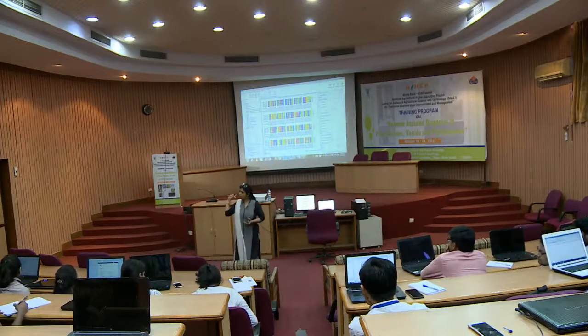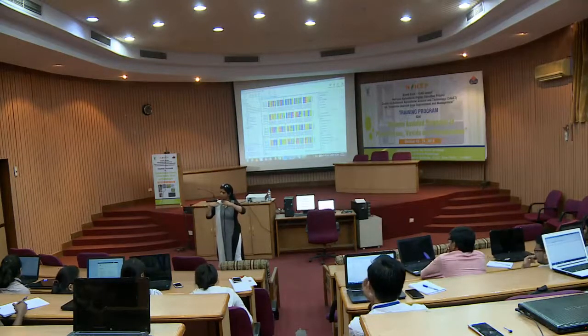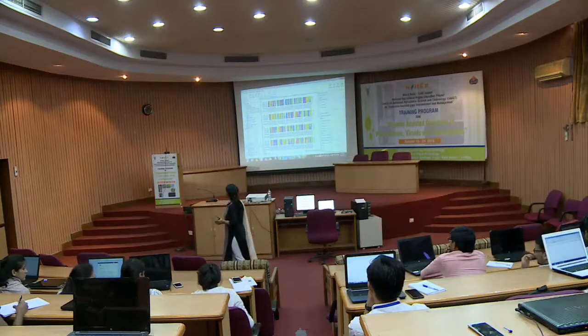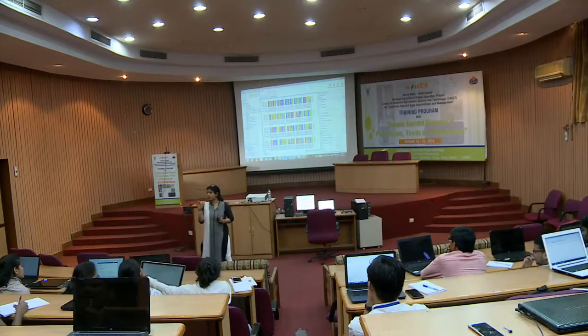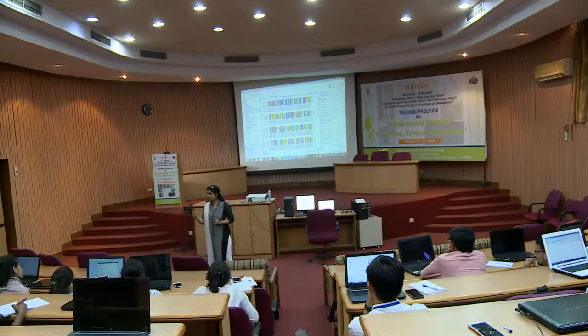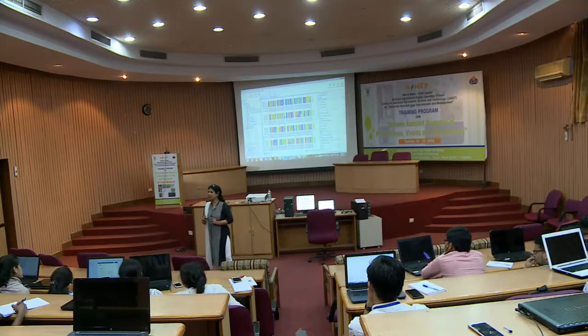No, when you will be making Contig, the software will take care, it will already convert it to reverse complement and then it will do. But when you will be checking it, let's suppose in forward you cannot find that good base, and you want to cross verify it in your reverse sequence, that particular chromatogram file of your reverse primer, you have to make it reverse complement, and then if you will check, then you will find it.